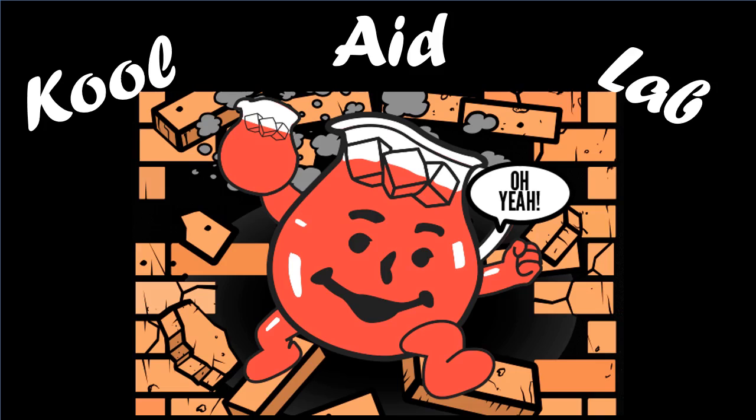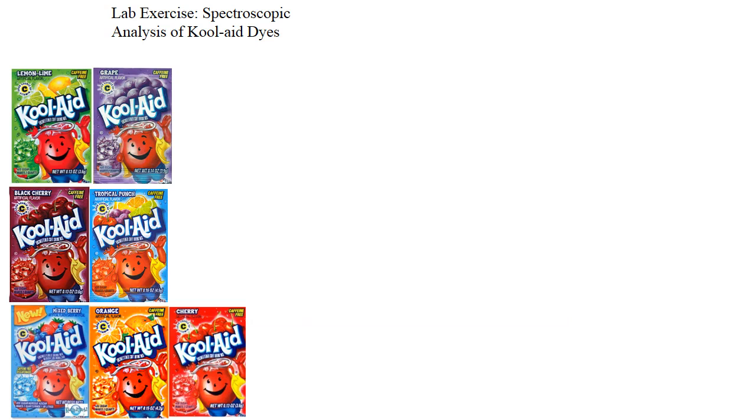Okay, so this lab is about the spectroscopic analysis of Kool-Aid dyes. So you probably know this, but Kool-Aid contains a variety of artificial colors and flavors. A variety of Kool-Aid packets are shown here, and I don't know which one you personally looked at, but we're going to talk about all of them.